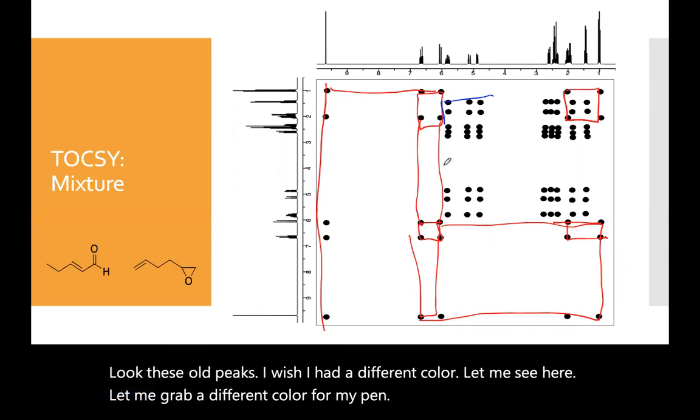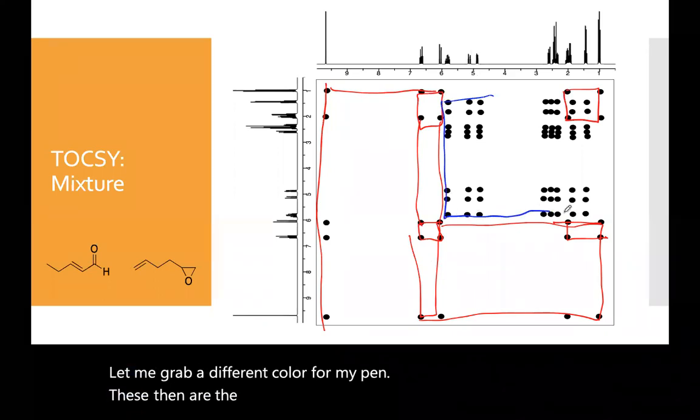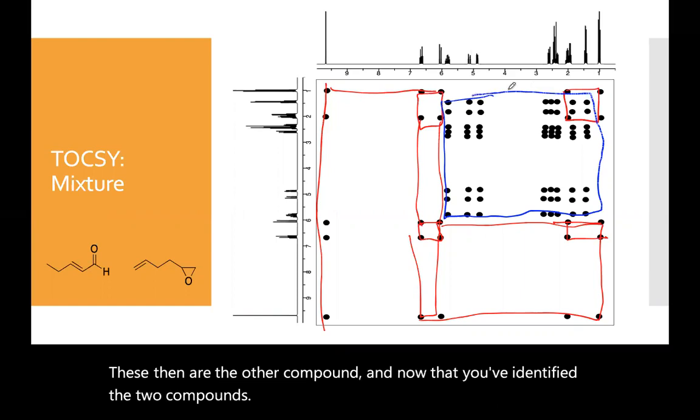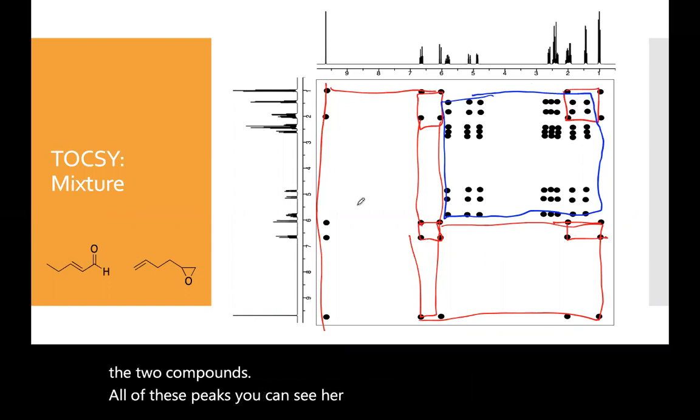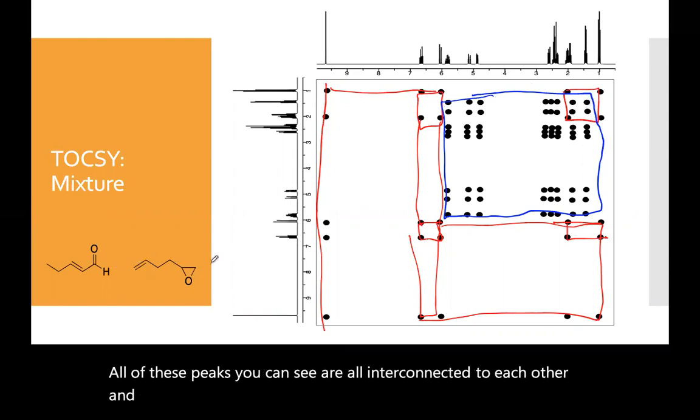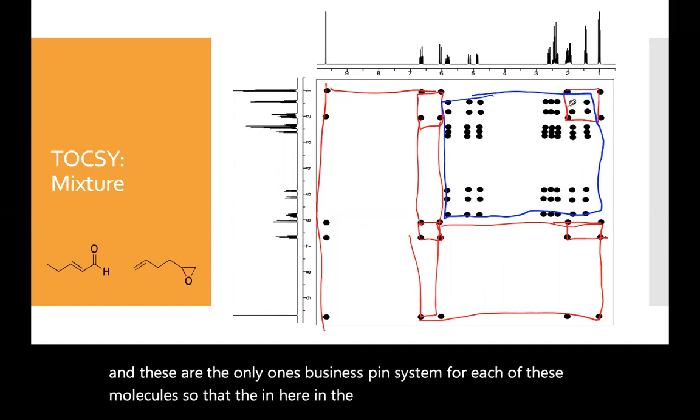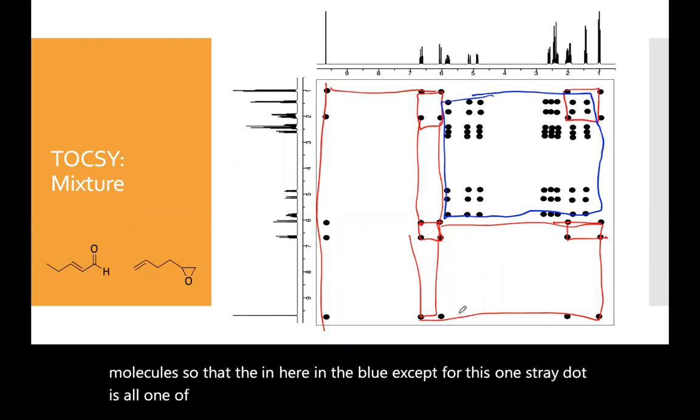These then are the other compound. And now that you've identified the two compounds, all of these peaks you can see are all interconnected to each other. And these are, there's only one spin system for each of these molecules. So you know that in here in the blue, except for this one stray dot is all one of the compounds. And this one is the other one. And this one has the aldehyde.